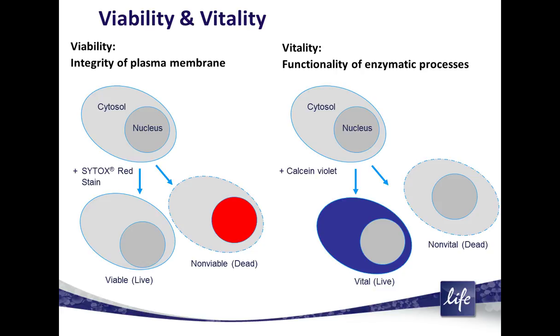Vitality is often referred to cells that display active metabolic or energetic processes. And there is obviously a gray zone in between these determinations. Some cells may show enzyme activity after the plasma membrane starts to degrade, and some cells may lose some metabolic function before the membrane damage becomes apparent.